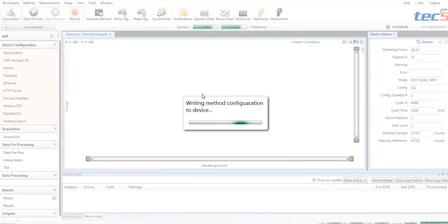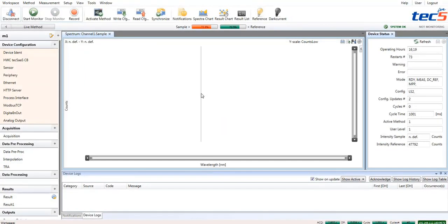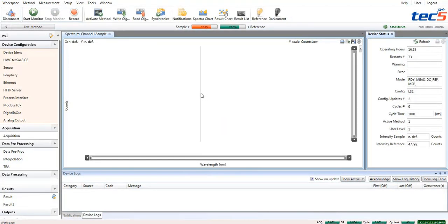Transferring. And now, data acquisition on the system is active with the selected parameters.